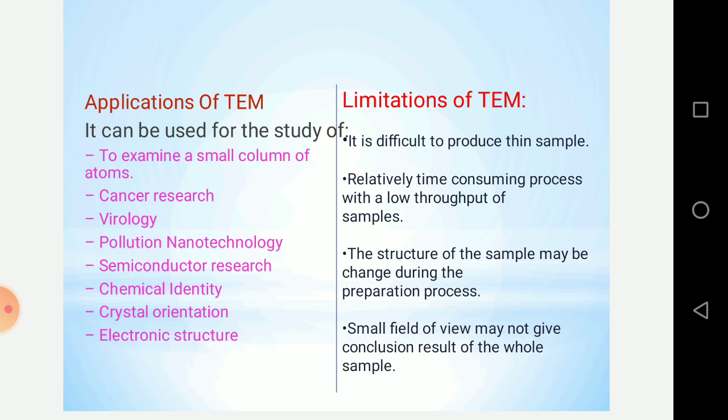These were the advantages of using the transmission electron microscope, but there are some limitations, meaning some disadvantages, of using this transmission electron microscope. So we will go through each of these.